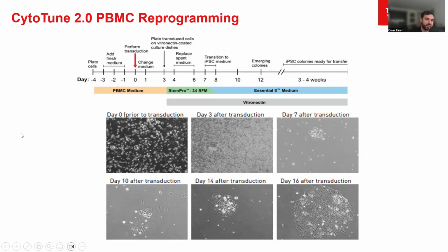And again, the Cytotune kit has a bunch of different protocols for these cell types that are outlined. So we're gonna briefly go over this one as well. I won't go into this one in as much detail, but I wanted to point out a couple different things that we've learned along the way, right?